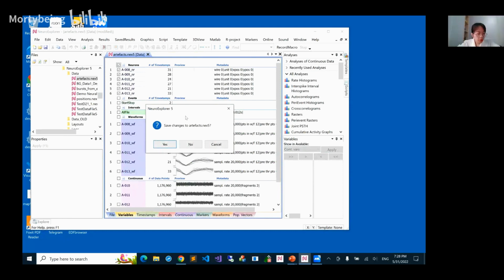One question. Is the 1D viewer available in your demo version? Yes, but it shows only the first 10 seconds of data. Okay, thank you.